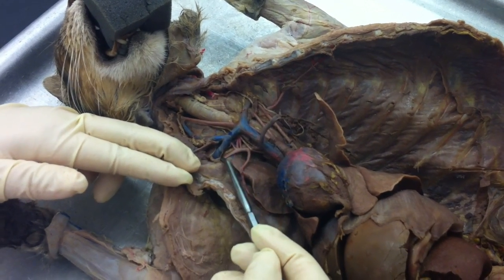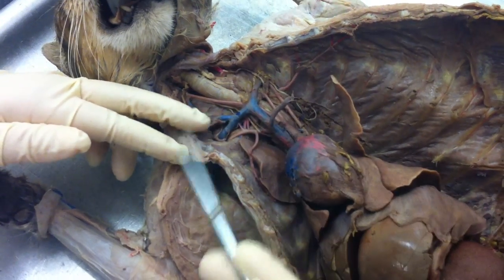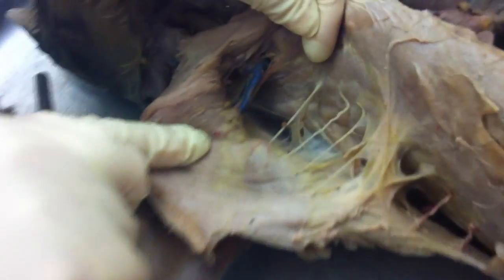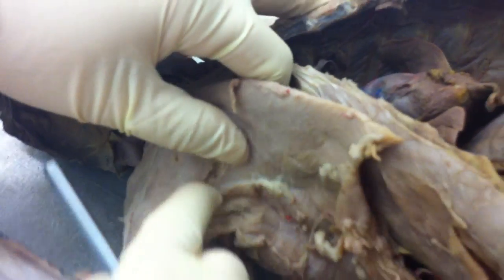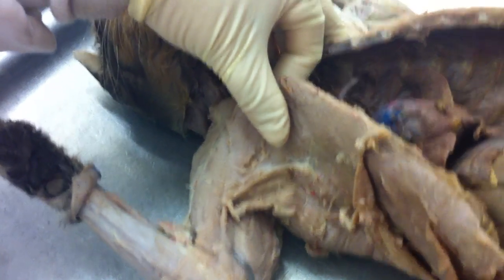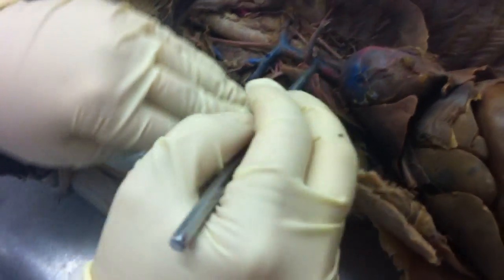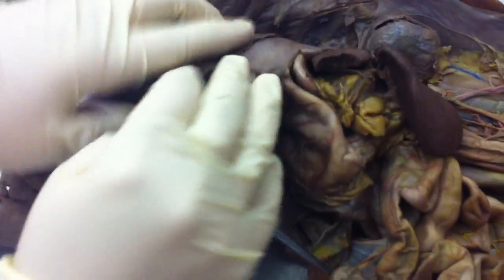This right here is heading out towards the armpit, so we're going to call that the axillary. And you can even see it in the armpit area there. Any pink in there? And then if you see it extending, this isn't fully dissected, but if you saw anything on the arm, that would be then the brachial artery. So that's the top half. You just have to follow those road maps, those diagrams.